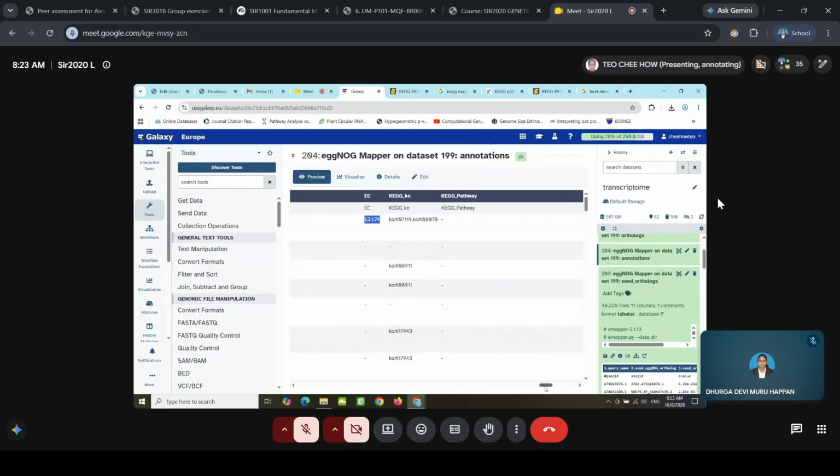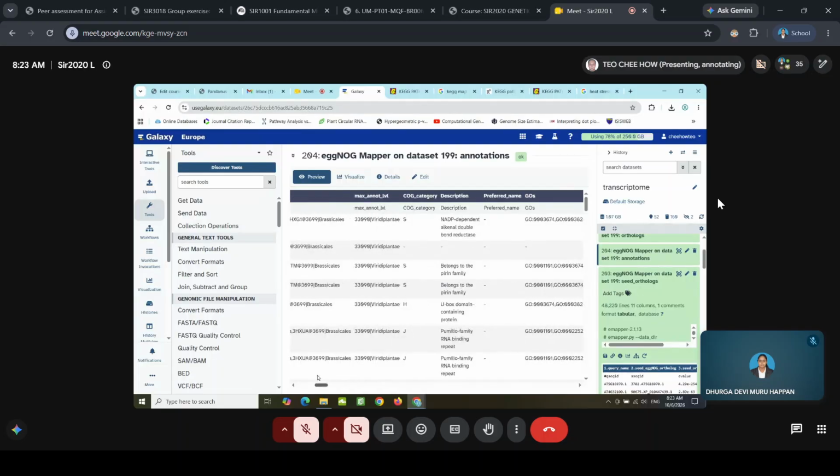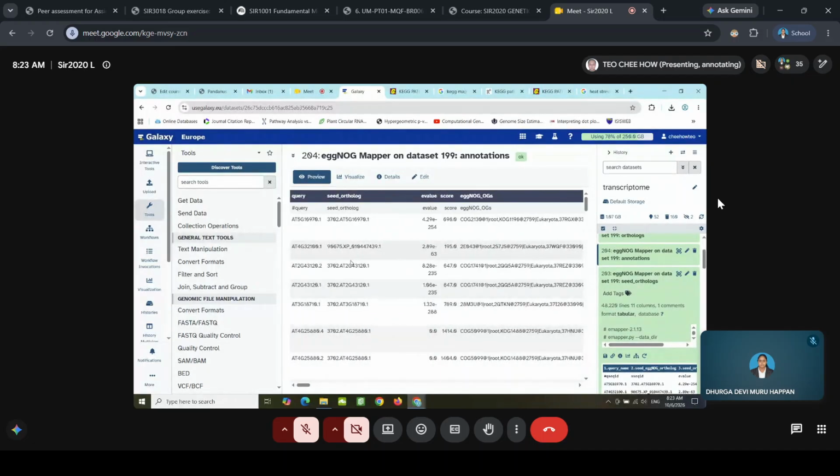And what pathway is involved. So this provides the information, and also what protein family they belong to. So ADH family. So this is for you to annotate your differentially expressed genes.